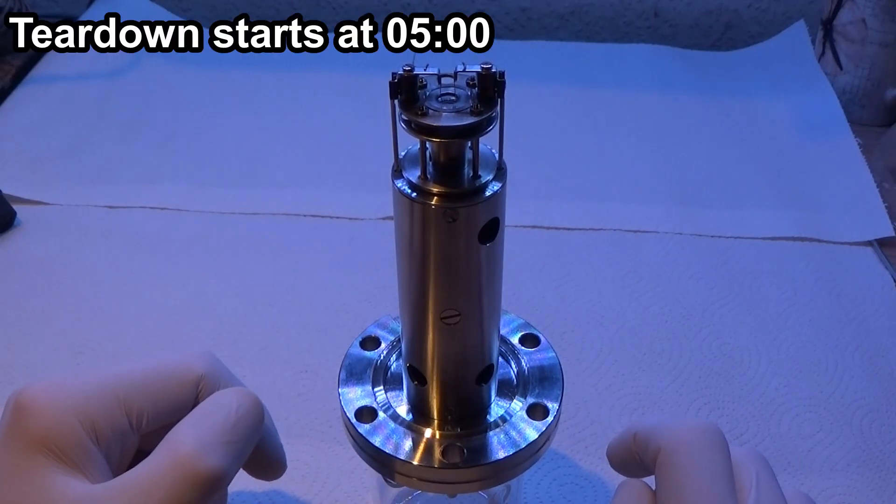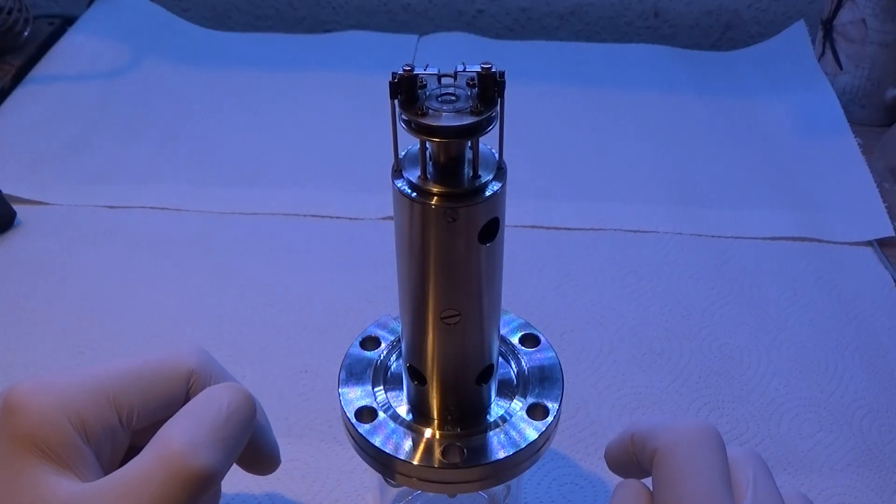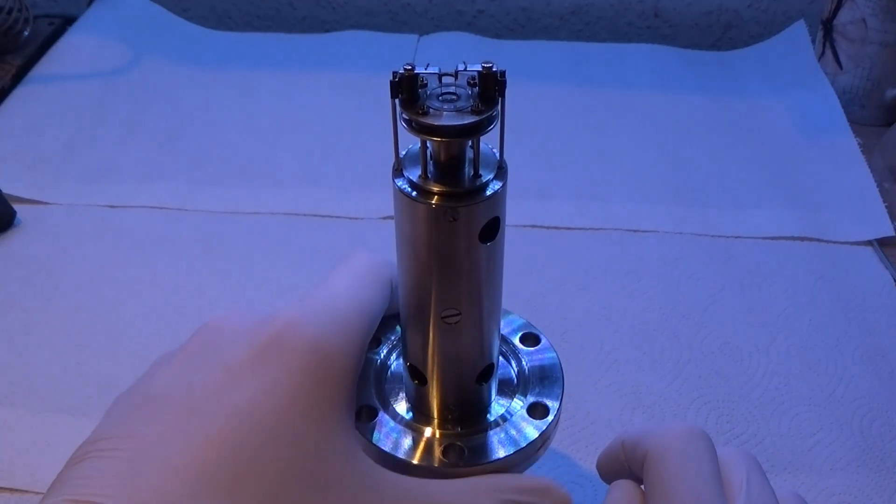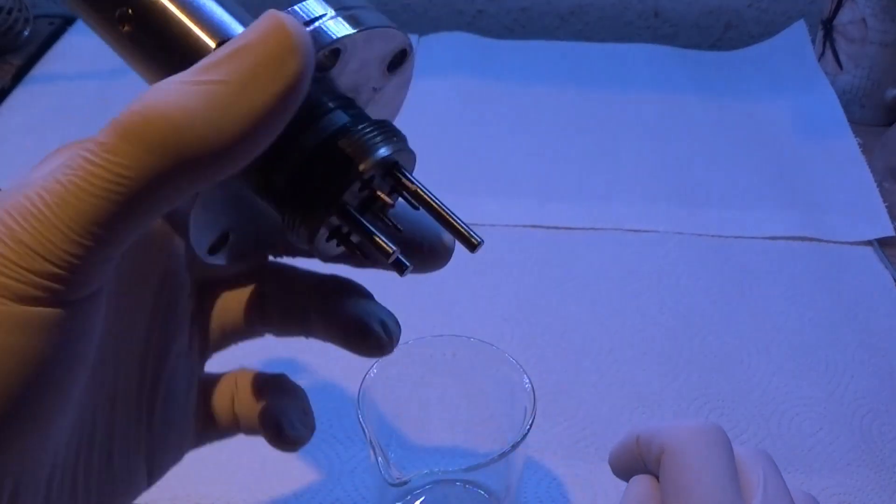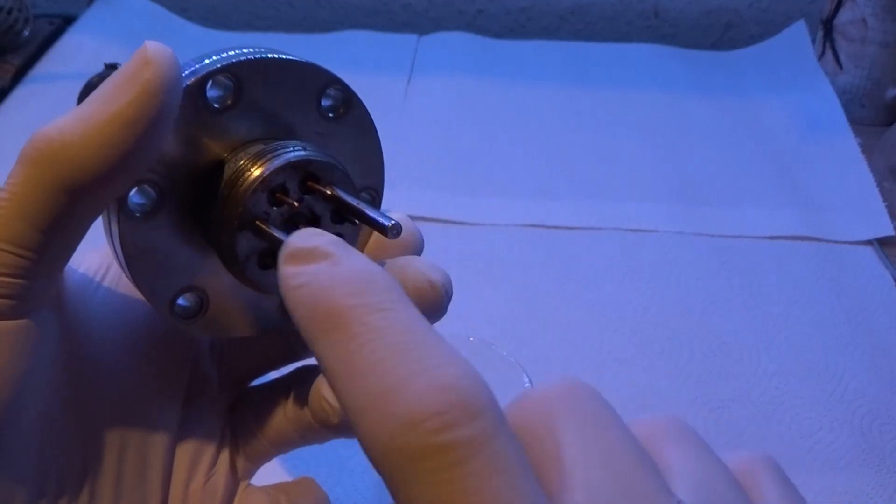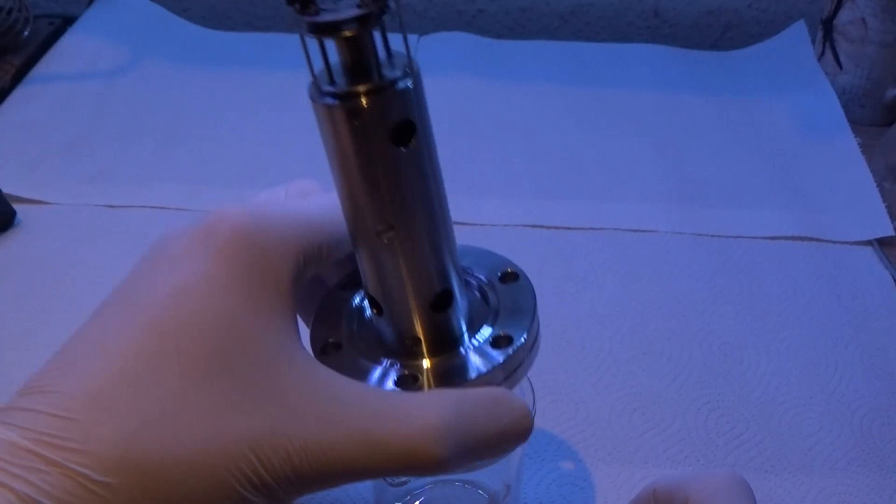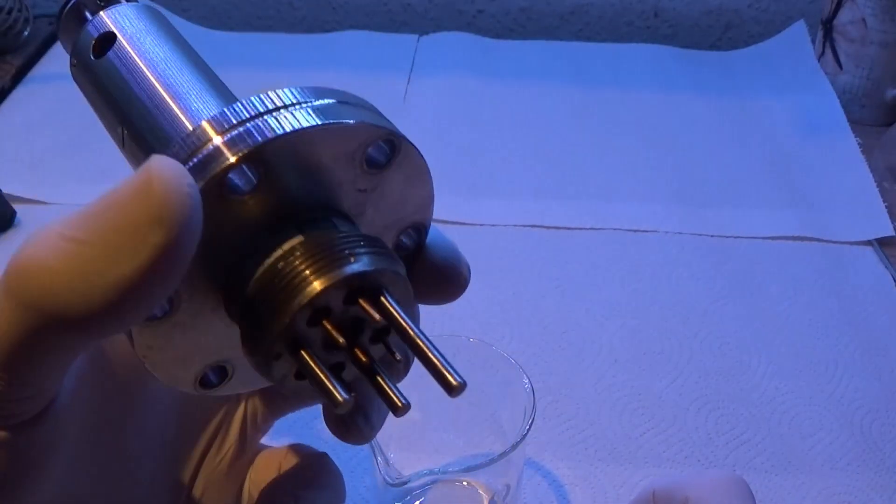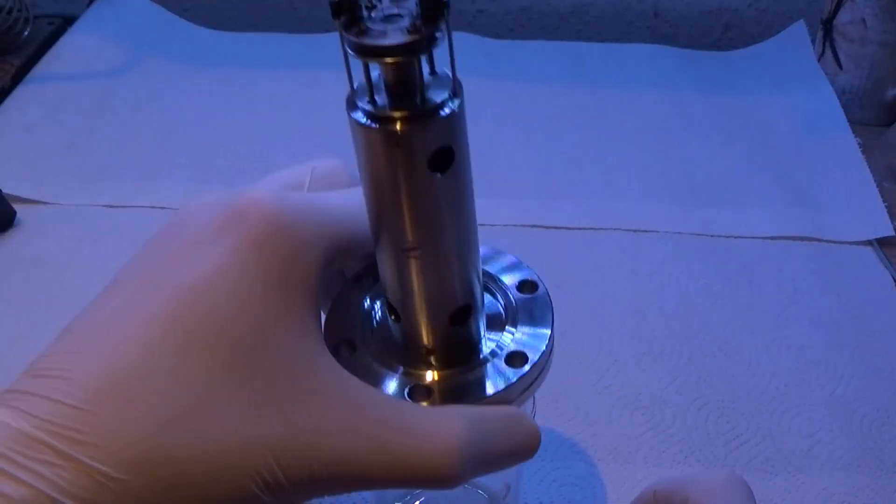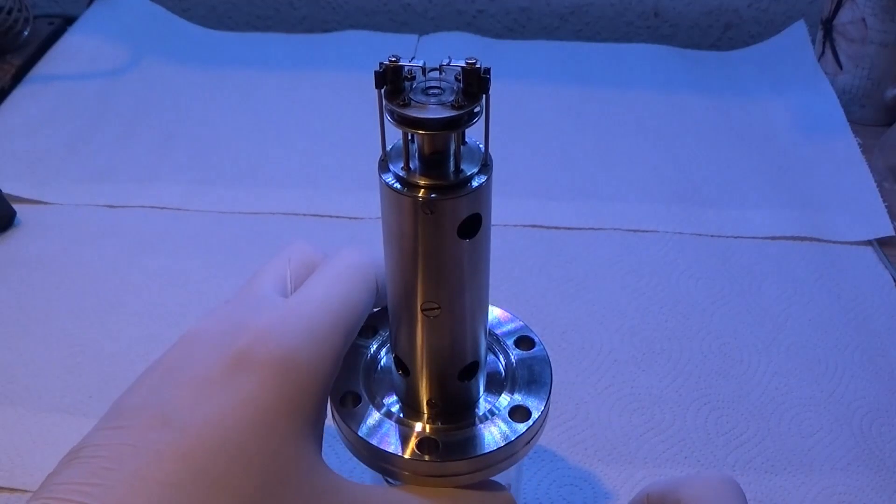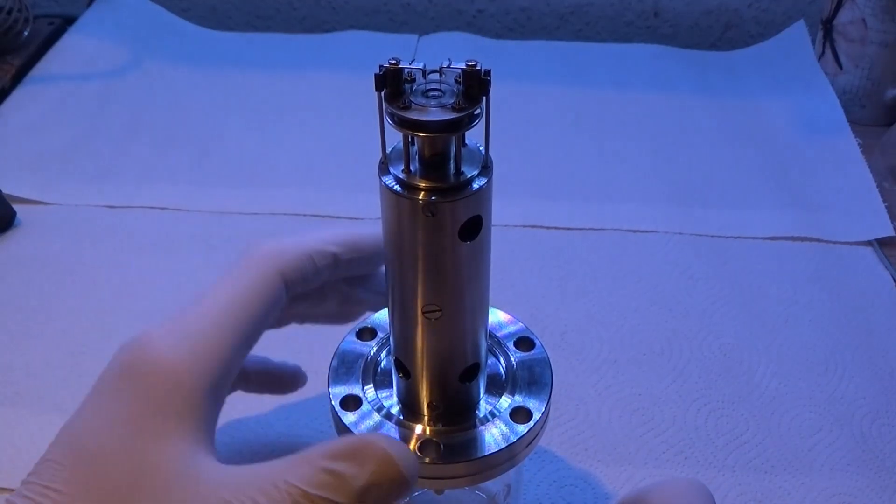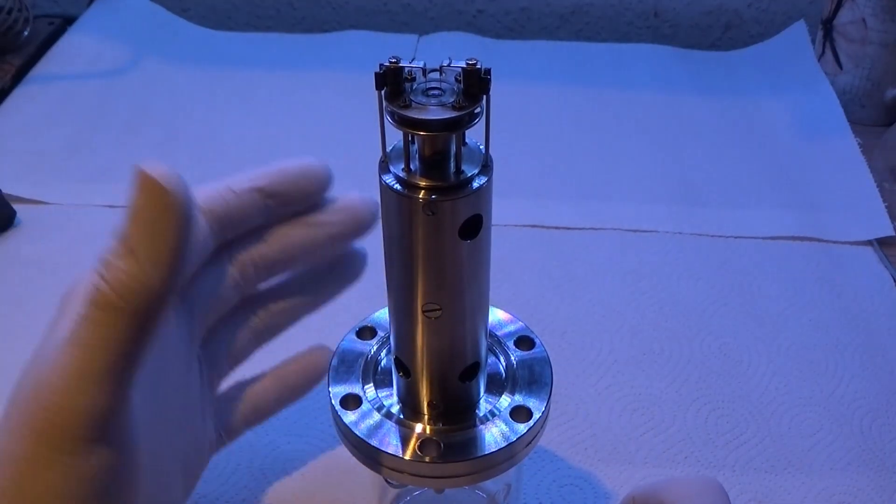So I got this almost by accident. I was buying some random vacuum parts with something that looked like a nice electrical feed-through, maybe a titanium sublimation pump. The images on eBay weren't that good, but I could only see these three big pins and assumed those were high current pins on a Conflat flange. But to my delight, it was actually a tiny mass spectrometer.